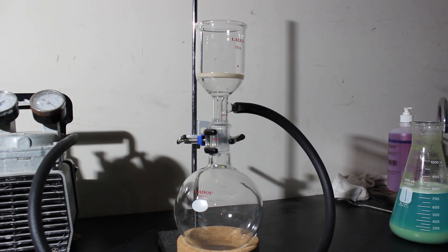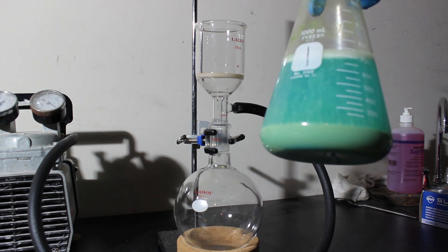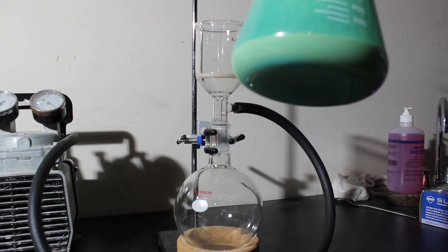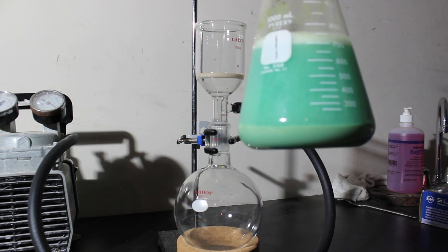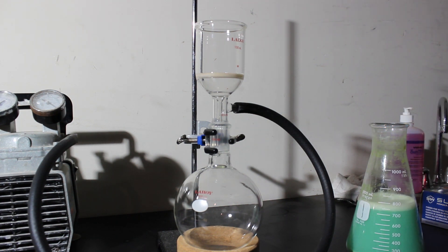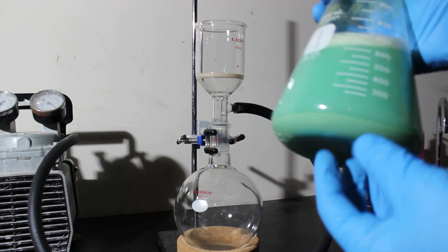I believe the reaction is complete. I'm still getting a little bit of CO2 evolution out of the liquid so I'll have to let it sit for a while. As you can see, the majority of the precipitate has collected at the bottom of the flask, which is ideal. I'm going to keep agitating this to make sure it's completely done reacting.